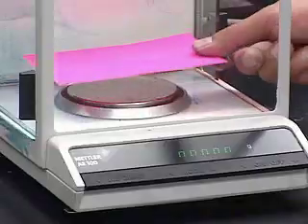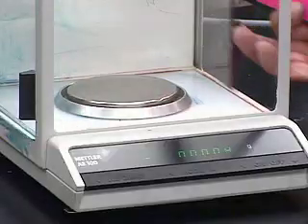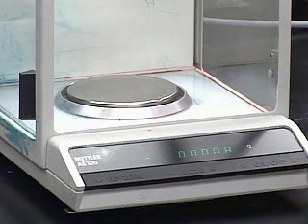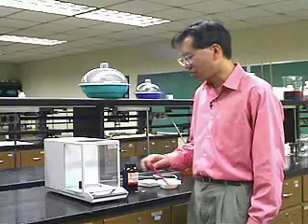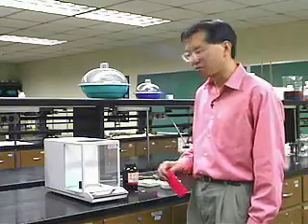First, let's make sure the balance reads zero. If it's not at zero, we need to correct that before proceeding. It's fine — it's ready to go. There's nothing on the pan and the display reads all zeros.